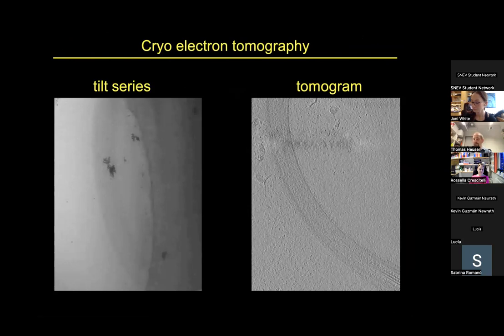You could also do this with this hybrid method, this high pressure freezing, followed by so-called freeze substitution, where you would also, in the end, have a resin-embedded sample that you can slice into pieces and look into. If you want to get 3D information of your sample, you can do this as well. But you are not against the chemical fixation. This is what I want to know.